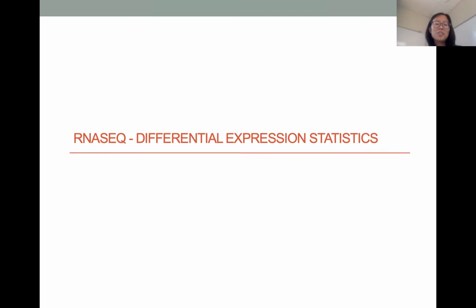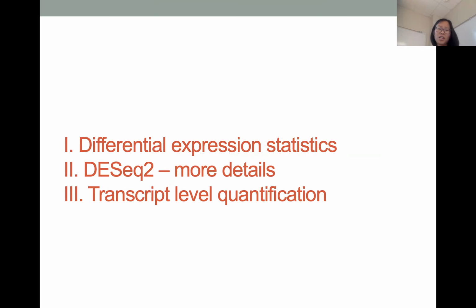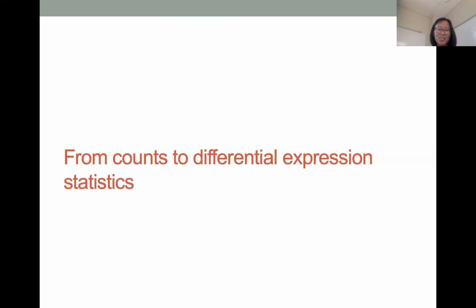Okay, I'm going to talk about the differential expression statistical analysis. We're going to cover 3 parts. I will talk about the first 2 parts, and Meg will talk about the last part. By the way, I updated one of the slides, and if you downloaded the former version, maybe you want to download the updated version.